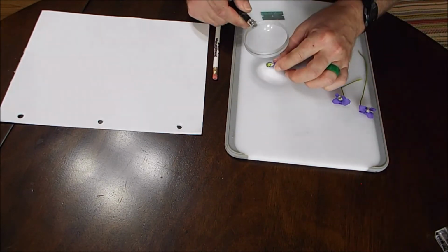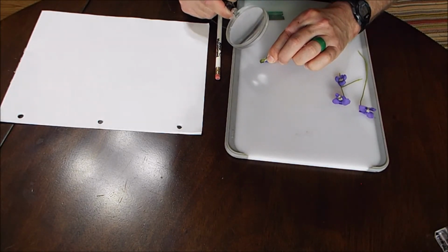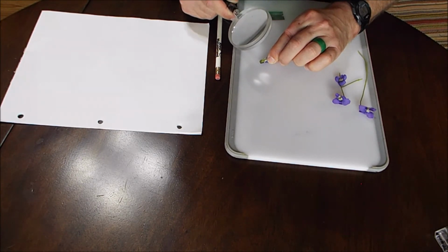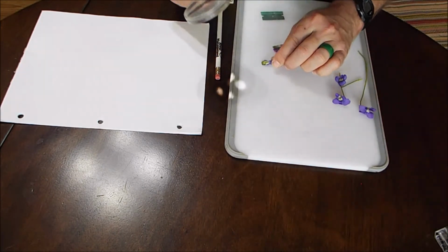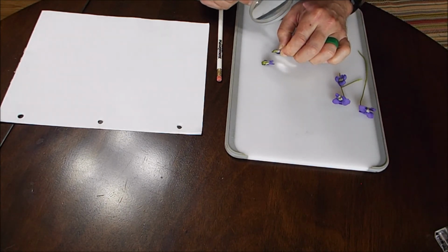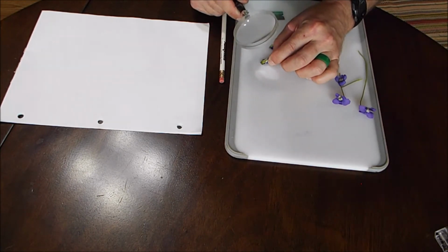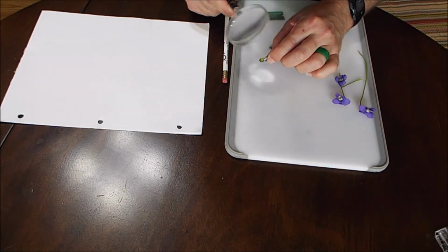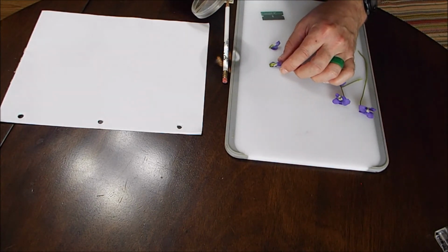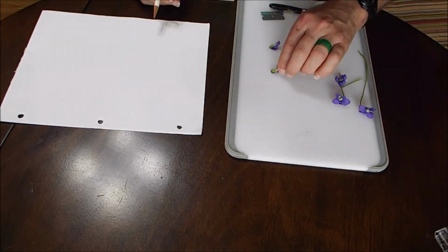Now I have this old magnifier here. It's not the best in the world. No, I may have missed it. Are they in there? Well, I'm really missing my dissecting microscope right now. I do have some good illustrations that I'll put on this page. Alright, so there it is. Now we've cut the flower in half. So this will be the dissected view.